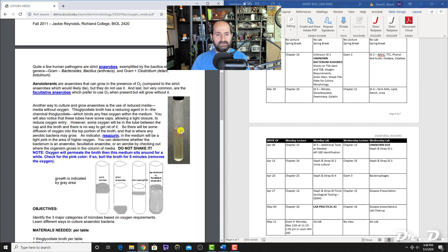The thioglycolate broth contains the chemical thioglycolate, which binds to any free oxygen in the medium, reducing the oxygen inside. The function of thioglycolate is to deplete and bind to the oxygen inside the media, lowering it.